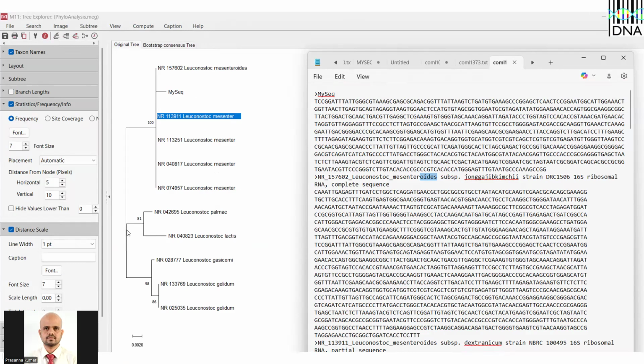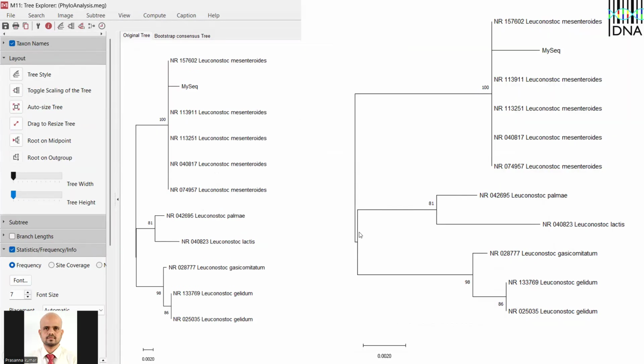And you also see here this branch length. Okay, this is not sufficiently seen. So what I will do, I will go here, layout, try to increase the layout for better resolution. See here now and see here now. I have just moved this tree width to 1 unit. Okay. Usually tree height, never increase it. Okay. Try to fit the entire tree in one page. So if you want, you can reduce the tree height. If you are increasing the tree height, it may go to 2 pages, or the tree will be a little not elegant. So just increase the tree width.